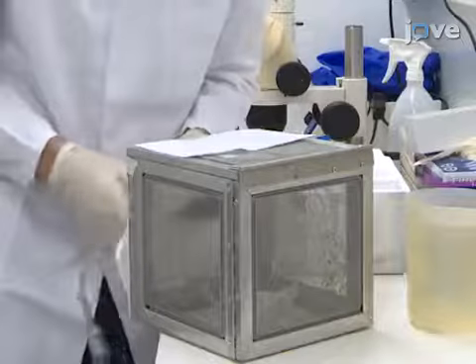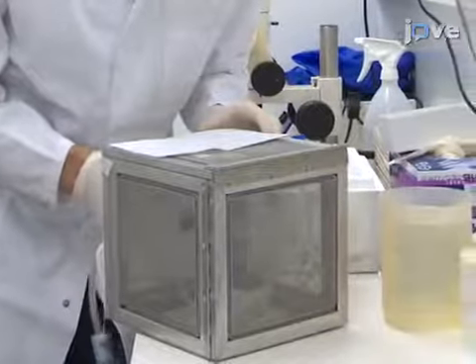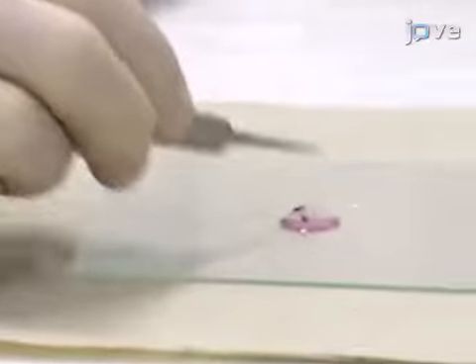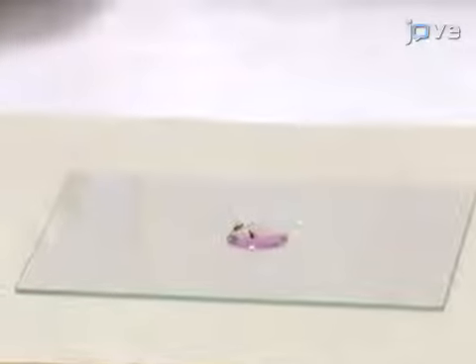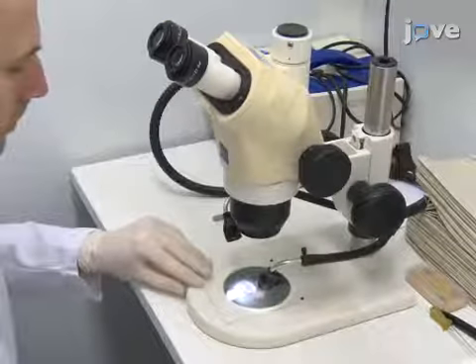Begin by collecting female mosquitoes from their cage 17 to 22 days after the blood meal. Use forceps to place three to four mosquitoes on a glass slide covered with a drop of cold RPMI medium. Then place the slide under a microscope.